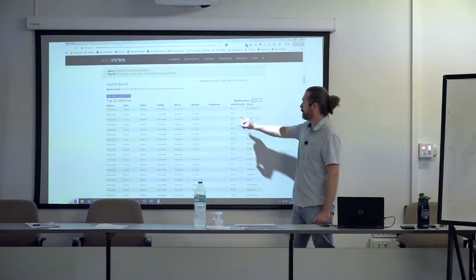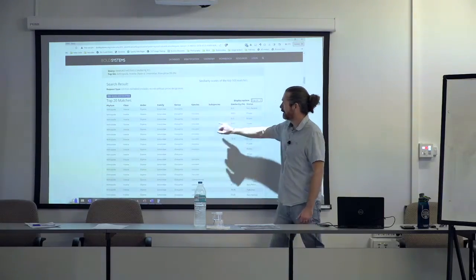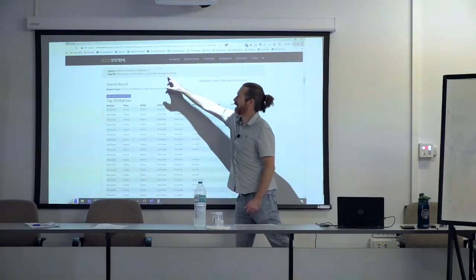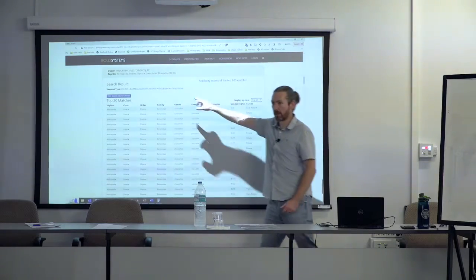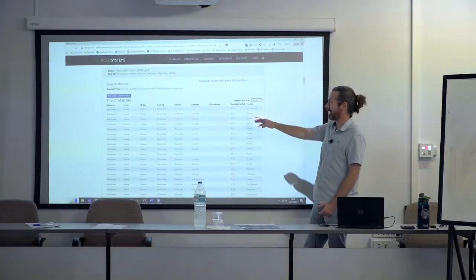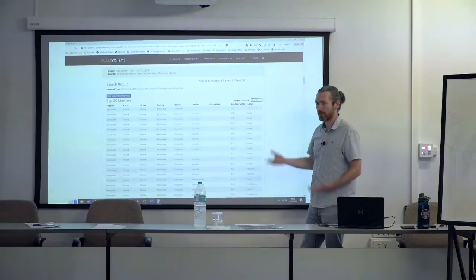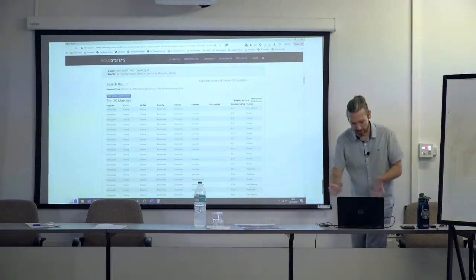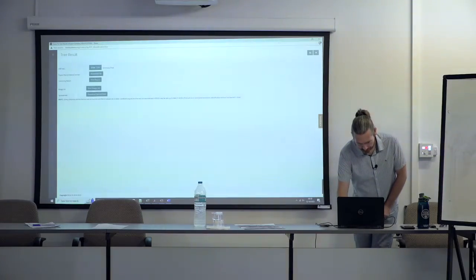However, the top match, 99.8%, doesn't have a species designation, and so Bold has gone along and said, I think it's in the genus, because it's looking at this underlying database, this data set, and it's probably saying, I'm not 100% confident I'm going to give you a species name. I'm just going to give you that genus name. So that's just something to keep in mind when looking at these results.